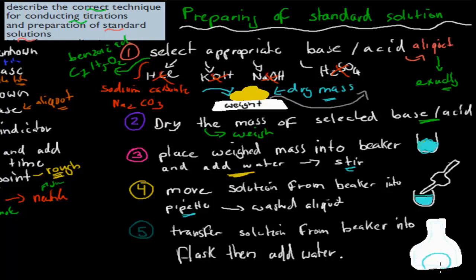So now let's say, okay, the stuff in the beaker we transferred into the flask, and that makes up so much of our solution. But you can see here we have actually much more. It's full, whereas here it's not full yet. And the reason why is because we know this whole solution might be really concentrated. Let's say it's 1 mole per liter. So it's a bit too concentrated. We don't want to have that concentrated.